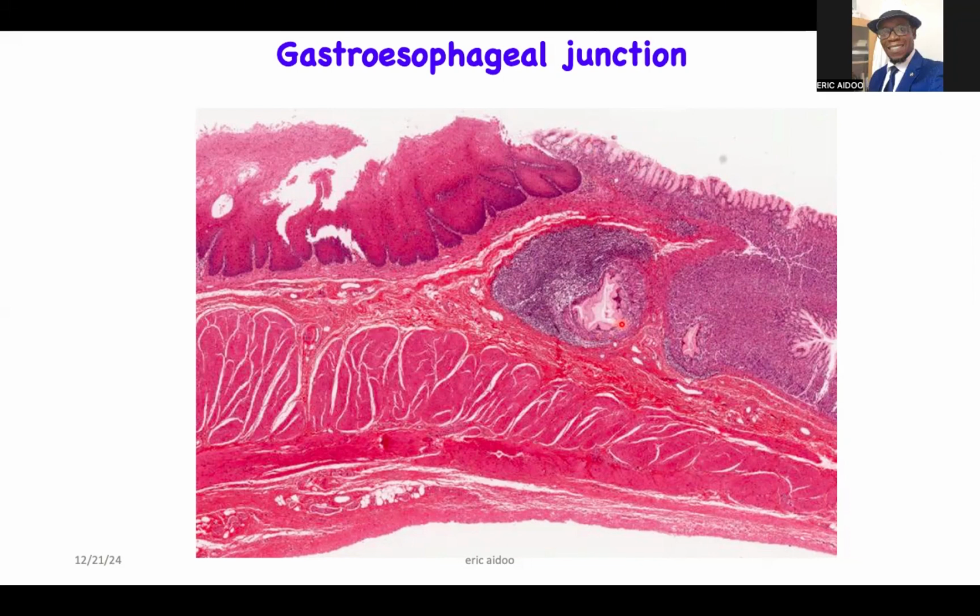Sometimes I call it vertical section when the tube that has been sectioned is actually very short, not too long, then it looks more like it has been cut from up to down, which is also known as vertical. But once it's a tube, it's more appropriate to say a longitudinal section.